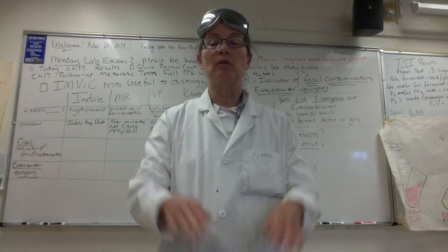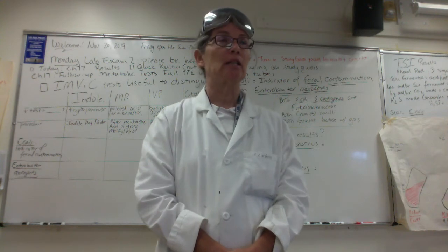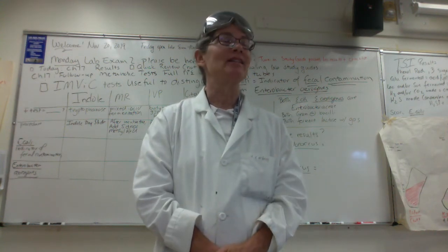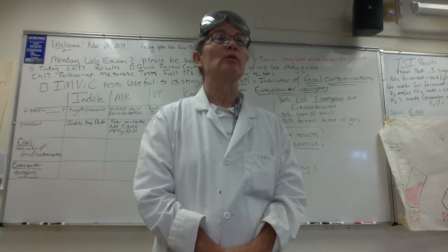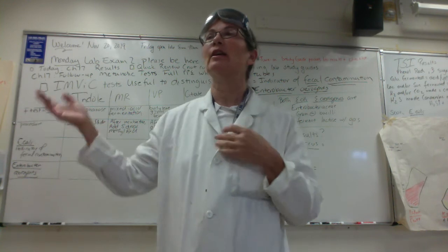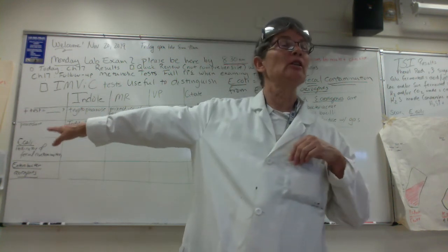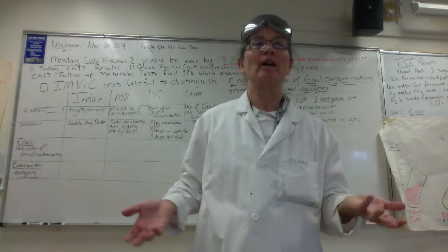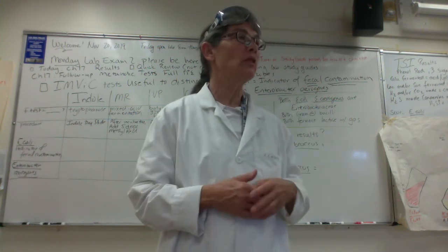Okay, so folks, what we'll do is we're going to stop the movie here, and then I'm going to give you like 5 minutes, kind of get organized, to read your results, record your results, and then I'm going to ask you, as a class, what our results were for E. coli IMViC and Enterobacter aerogenes IMViC, and we're going to discuss why these tests are helpful, right?